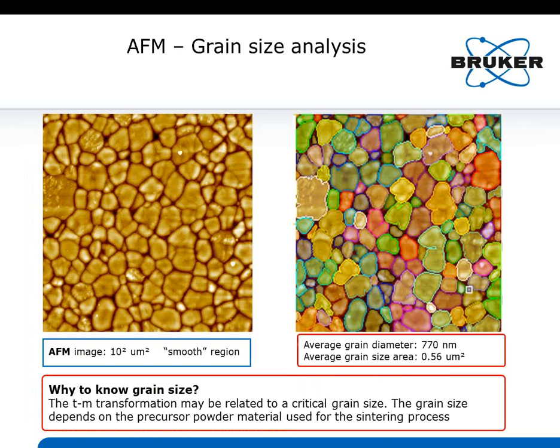Now we can zoom even a little bit further in here. We can look at the grainy structure on one of these smooth areas, and then we can measure the grain size. Again, that's now beyond what you can do with most optical microscopies.